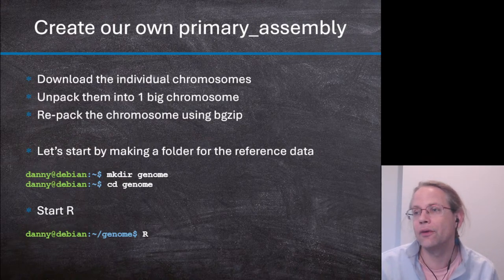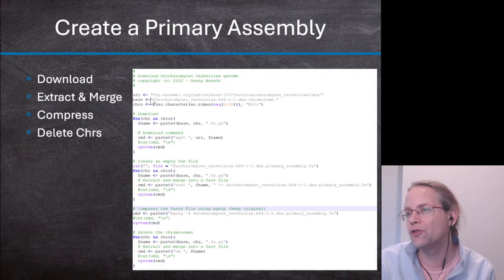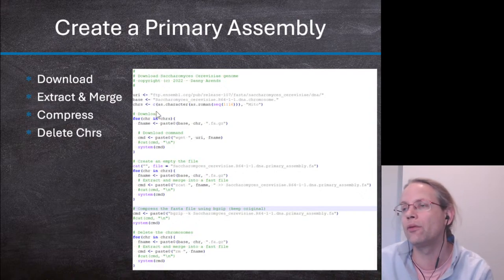Let's start doing that, right? So I wrote a little R script. I think if you look online in the gist, it is called buildgenome.r. So this buildgenome.r, let me show you guys, it looks like this, right? It's a very, very small file. It does exactly these three steps that I was talking about.